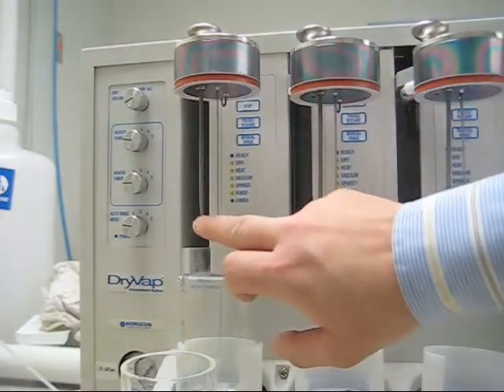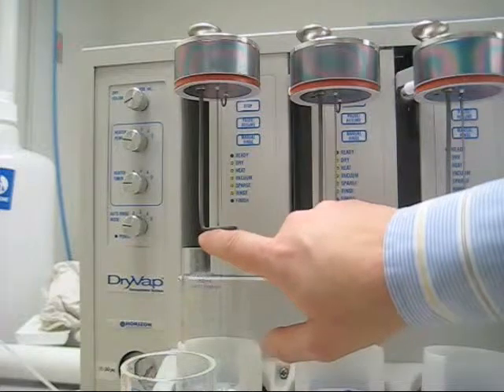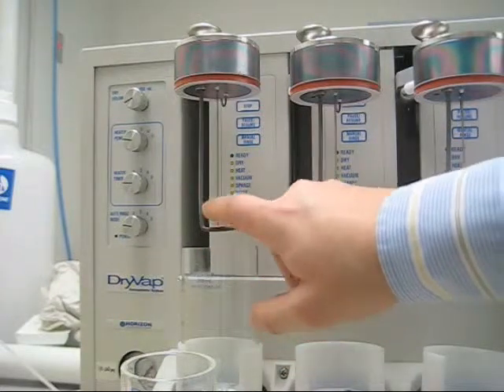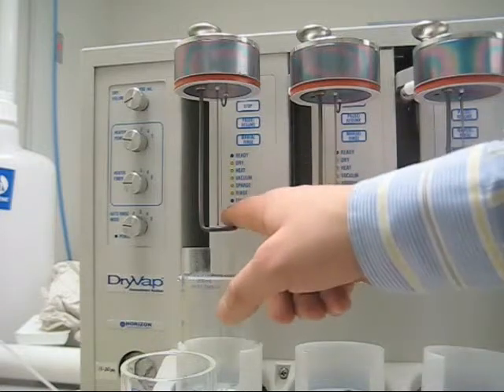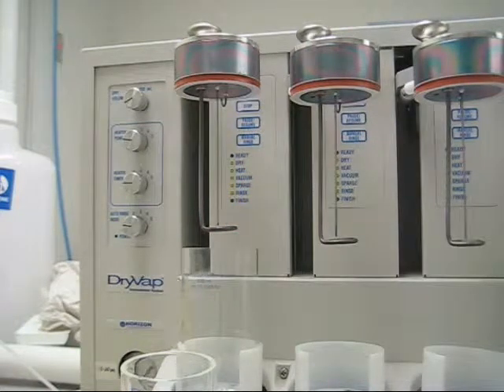This heater assembly here has a thermocouple right here between the coils and the actual straight part of the heater. This tells the heater when to shut off. When that solvent has reached the thermocouple, it will automatically shut off so you don't have a direct heat to your analytes.